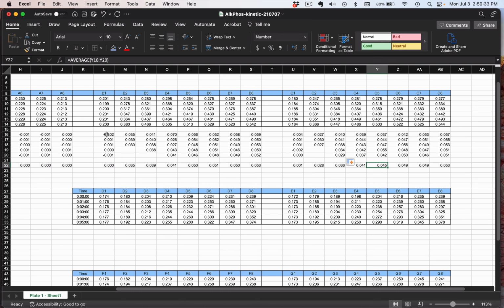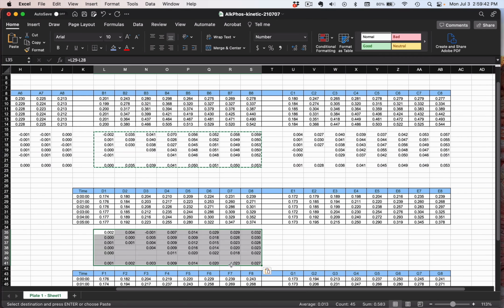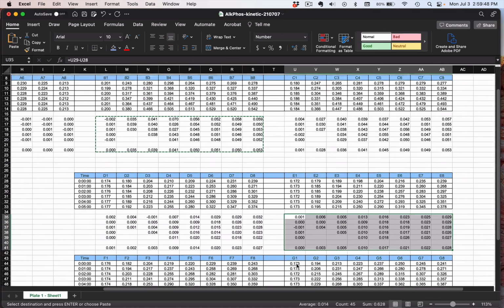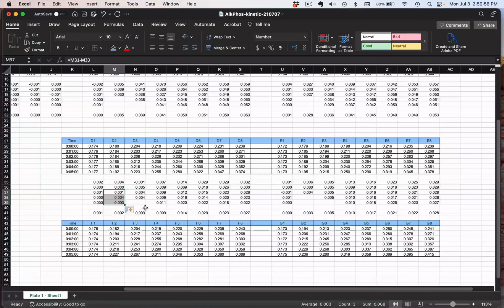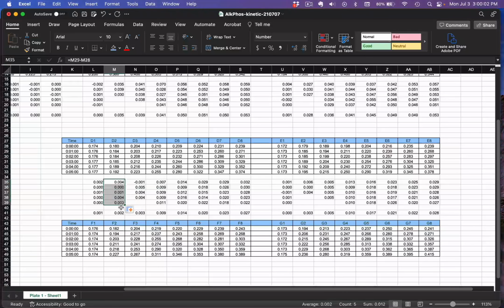So you want to actually compare those points. So now I'm going to copy this entire block, and then I'm going to go down here, put that in that cell right there, and I'm going to go ahead and paste that. Do a similar thing here. Once again, we're just looking at now the inhibitor study, and we'll go ahead and extend that down to see. This is once again most likely a poor mixing, but I'm going to go ahead and keep all the data there because it looks a little bit more indicative. If we look at this, I'm going to extend that down. I'm going to go ahead and keep all that data as well.